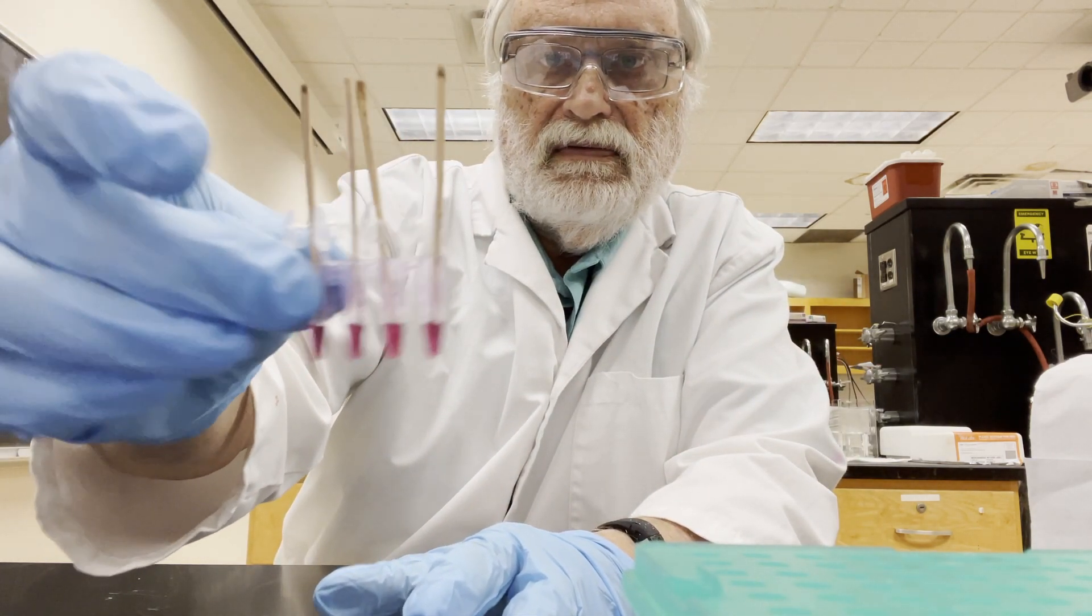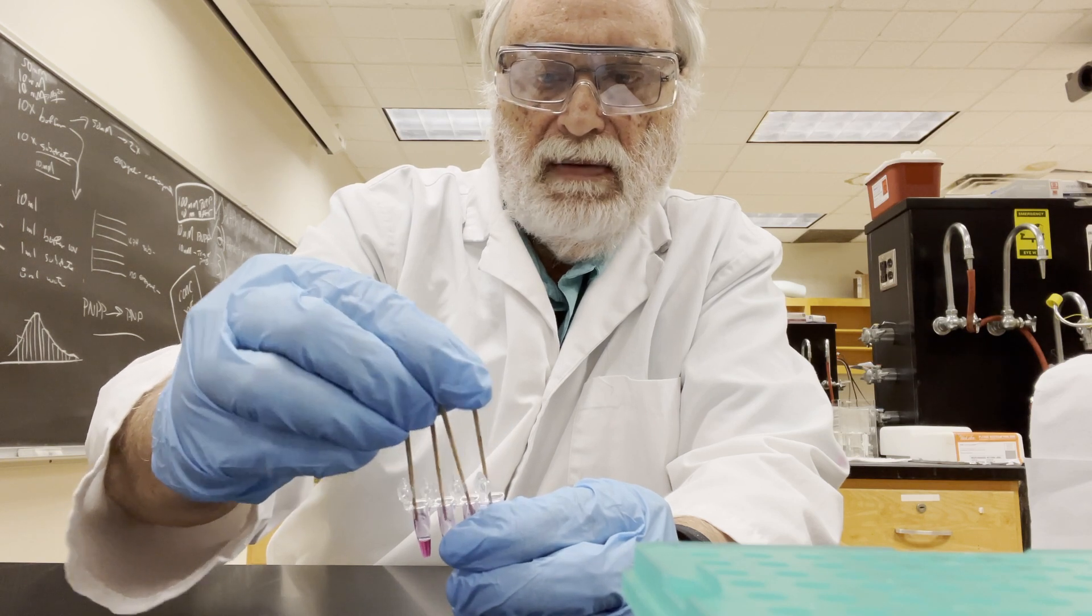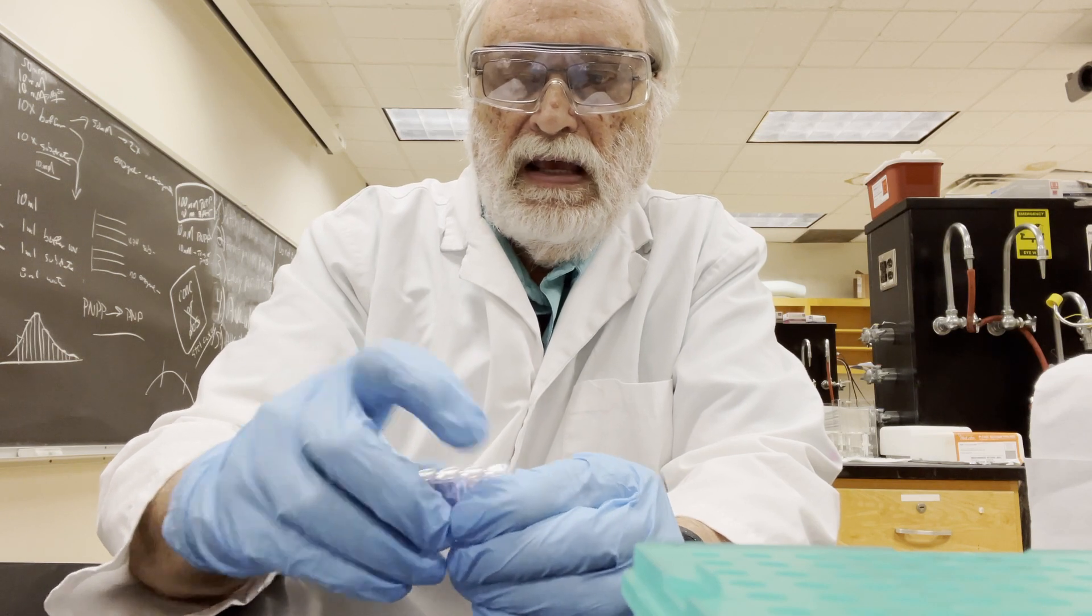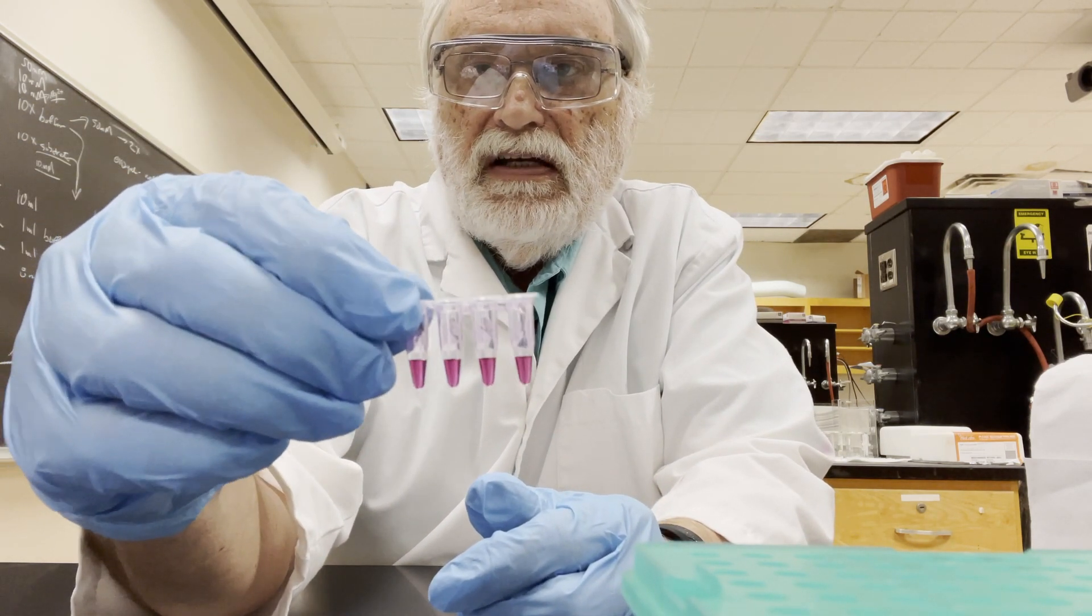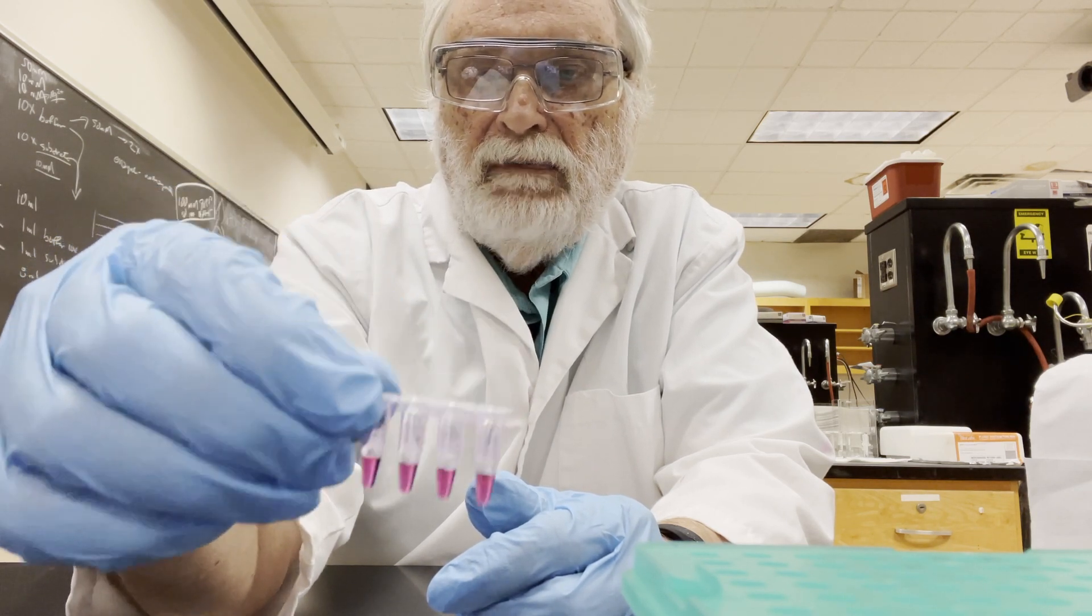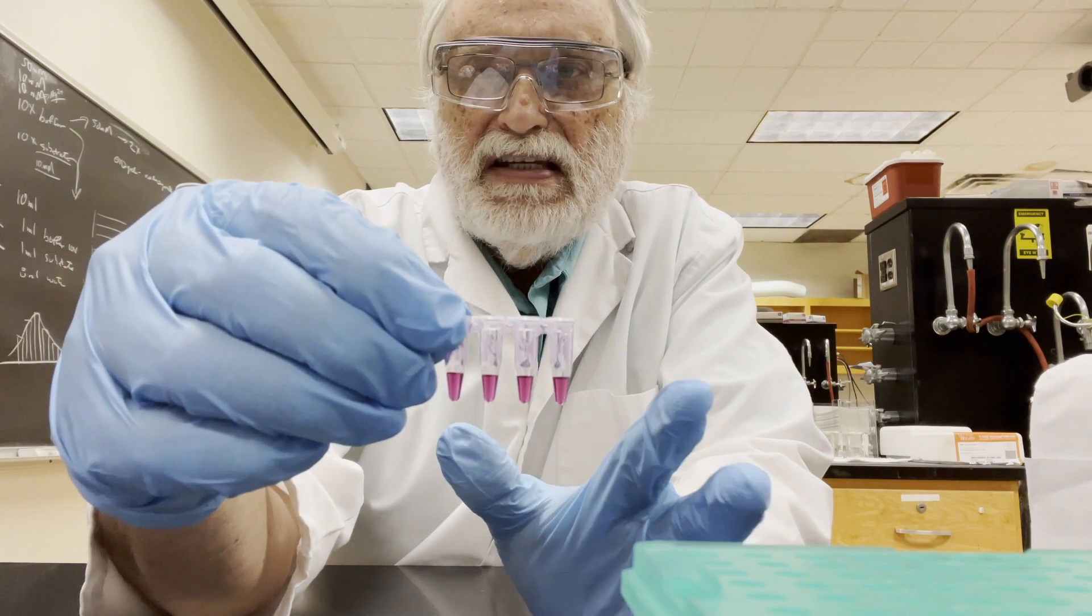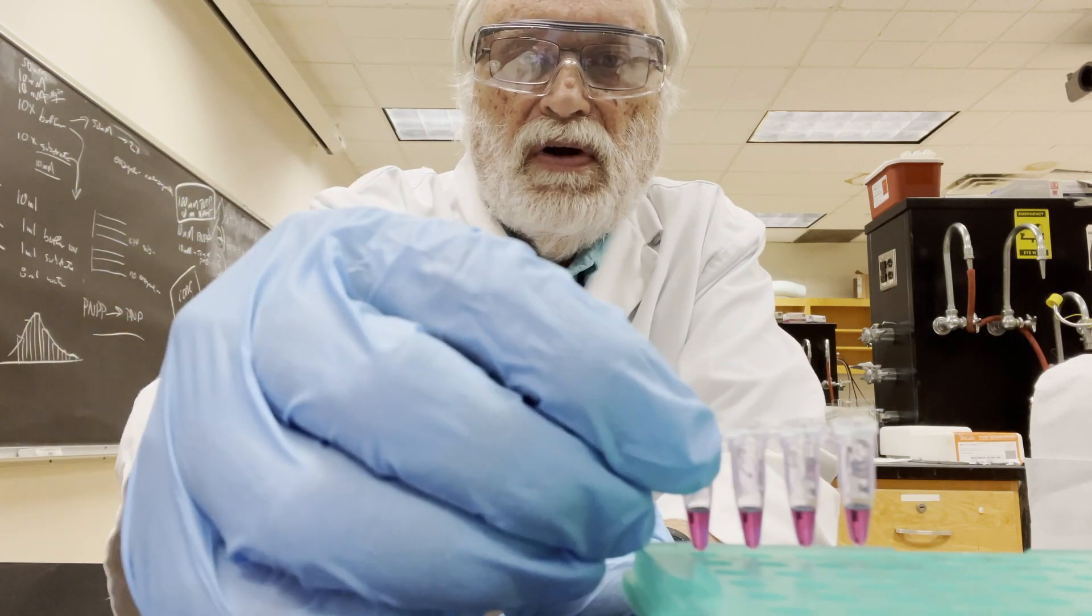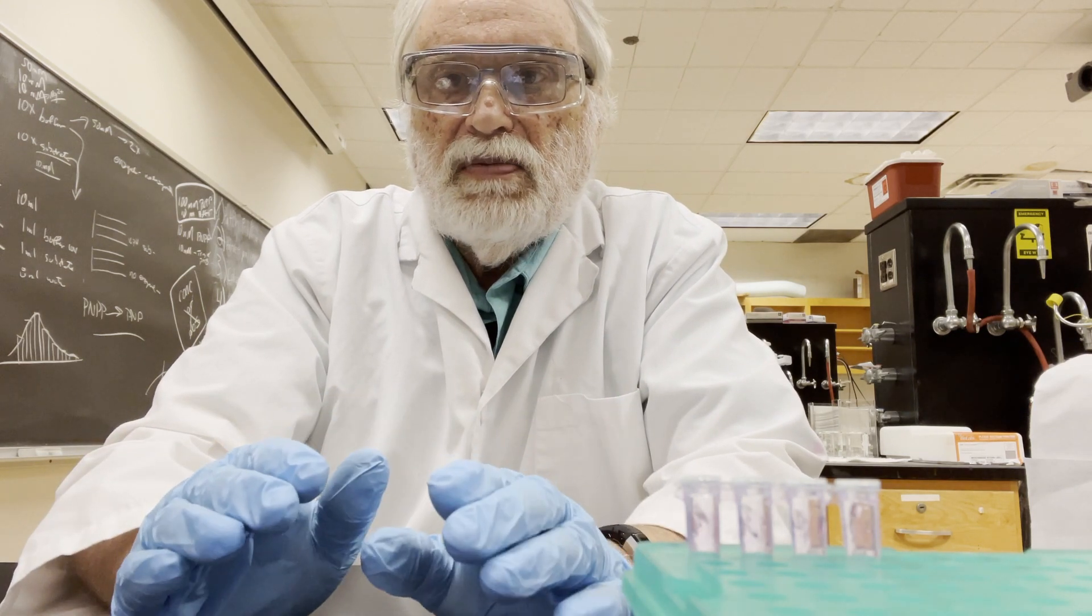I will shake all four toothpicks. Pick them up, shake that a little bit, throw them off to the side, and put the caps on it. And you've already shown this before, the previous experiment where we did colony PCR for E. coli. I'll just take these over. These tubes will go over to the thermocycler. They'll sit in the thermocycler for about 2 hours, maybe 2 hours and 10 minutes. And at that point, we're going to take these samples out and run an agarose gel on them. So we'll be doing that today. And that's our experiment for the day.